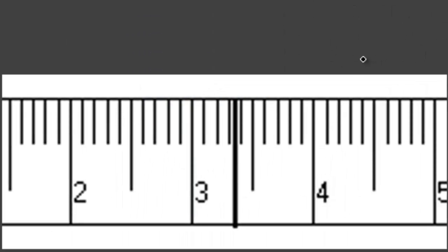For the ruler, we're going to do the same idea. We're going to start over and read until we hit the line. So we assume we started at 0. Here's my 2, here's my 3, so my number of large lines I've passed, or full centimeters that I've passed, is 3. So I've got 3 points. Then little lines, I've passed 1, 2, 3 little lines. So this will be 3.3.